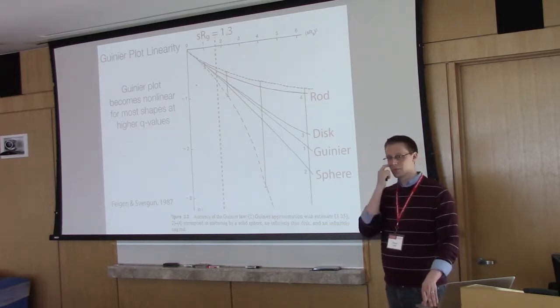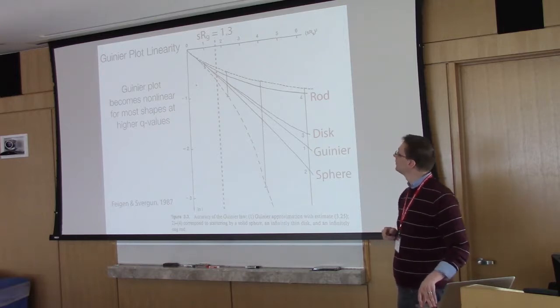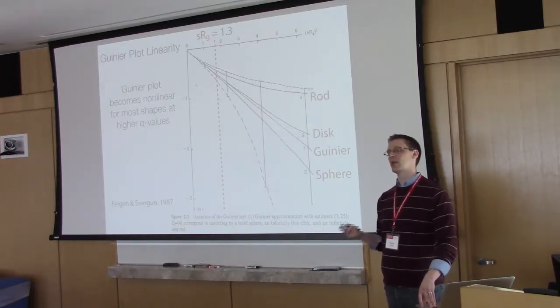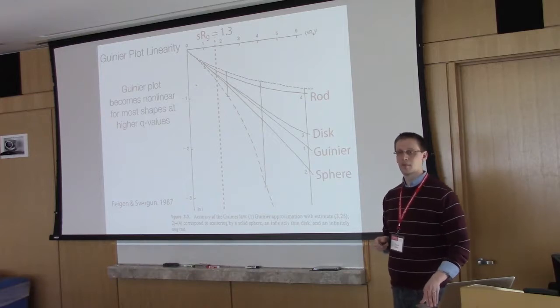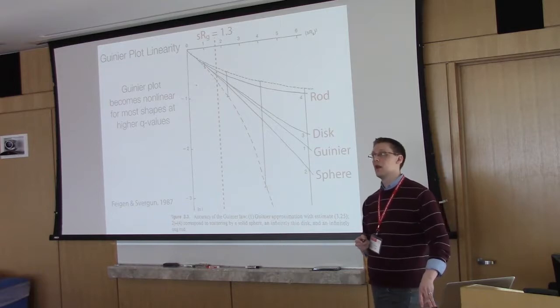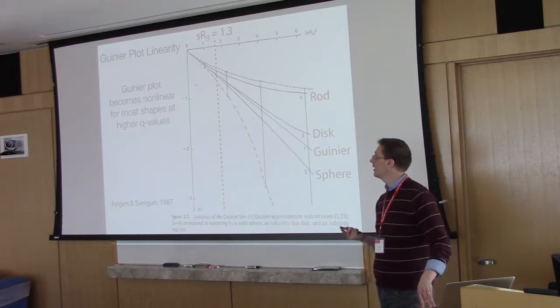But so you can differentiate between a rod-shaped distribution and an actual aggregate, just based off of how close it is to the straight line at 0? I would not necessarily say you could distinguish between them, because unless you knew ahead of time that it was rod-like, you wouldn't necessarily know if it's aggregated or elongated. So if you get a smiley face, is it safe to assume that you always have aggregation, or do people automatically ask, is this just a rod? Yeah, it's hard to tell.